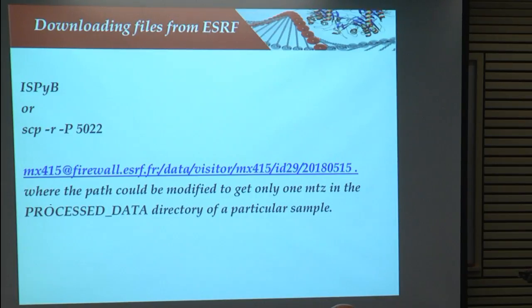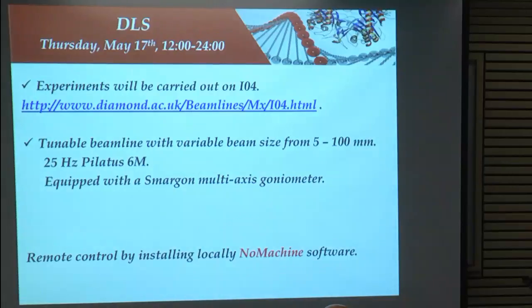Even if you decide to travel in Israel after the workshop, you will have time by the time you come back home. At DLS, again, the experiments will be on I04. And again, it's a tunable beam, and that's the size of the beam.